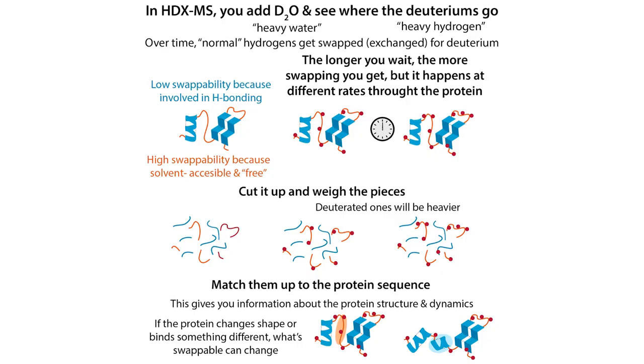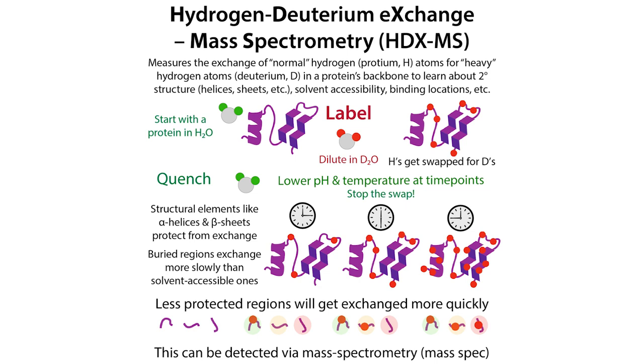It's important to know some of its limitations. So again, you're not getting the high level of structural detail that you would be getting from a technique like crystallography or cryo-EM. However, you are getting this information about dynamics, information about solvent accessibility, all these various things. So really cool stuff that you can do with HDX-MS, and there's so much I would want to do with HDX-MS if it was more readily accessible. But I'm really grateful I got to work with it in undergrad, and I hope that it becomes more accessible in the future and more people could use it. But for now, we can at least all admire the results from experiments with HDX-MS.